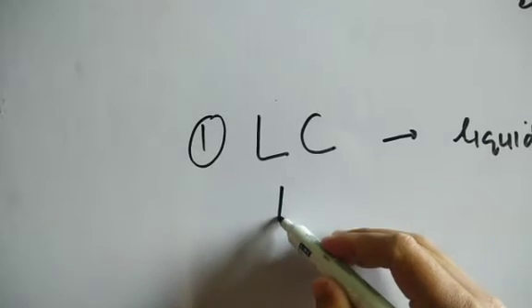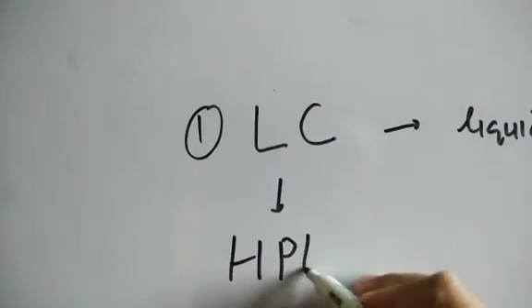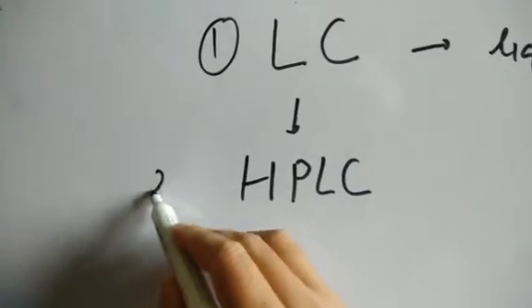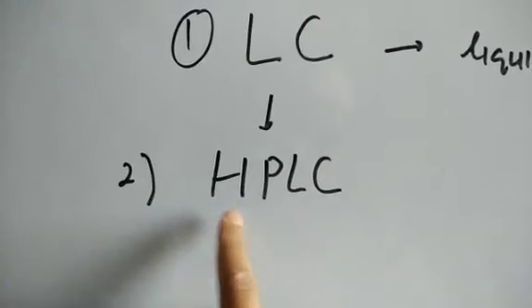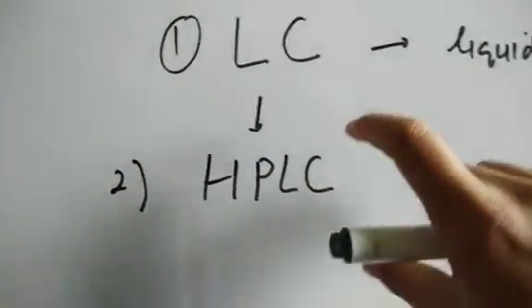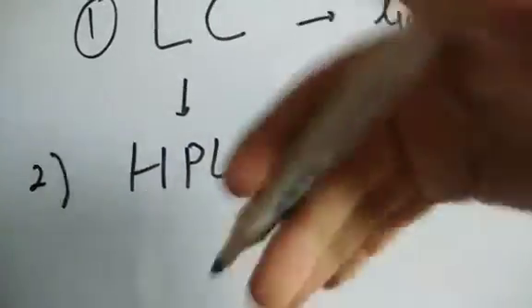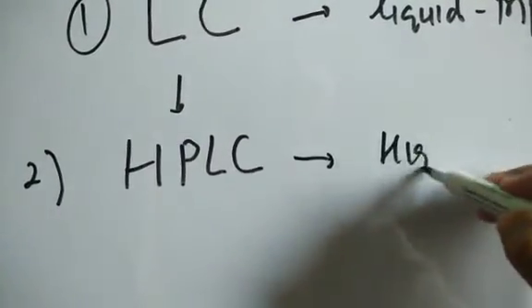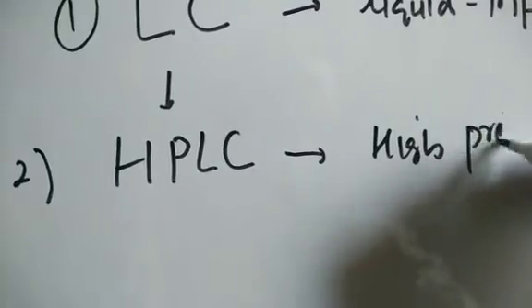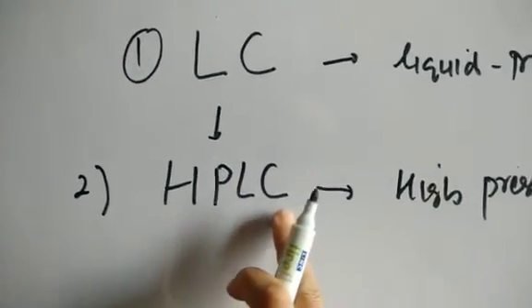The liquid chromatography can be HPLC, another term. ठीक? That's high pressure or high performance liquid chromatography. ये होती है liquid chromatography, but इसमें हम solvent जो mobile phase है, that is poured in the column under pressure. So under high pressure हम इसमें pass करते हैं उसको. तो ये बहुत ही advanced technique है for different applications. It's called high performance liquid chromatography or high pressure liquid chromatography.